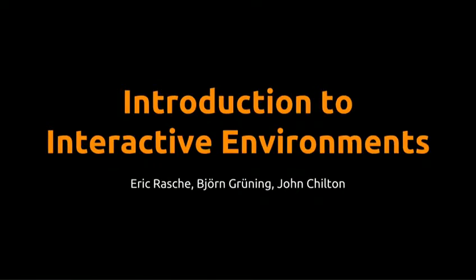So this workshop is now a simple introduction into an interactive environment. There's two sessions, so we started about doing a really simple one, and we probably don't need 2.5 hours today. But this one is for introducing the concept of interactive environment and giving you a small glimpse of what's possible now in Galaxy if you have interactive environment. So tomorrow we will try to integrate or develop this new interactive environment. Let's see if this works out.